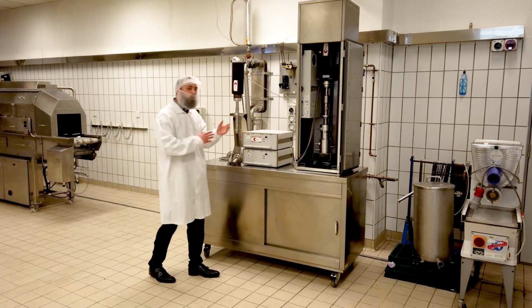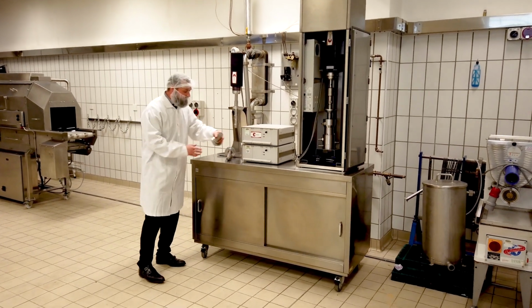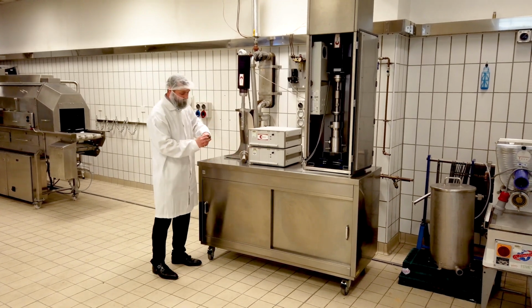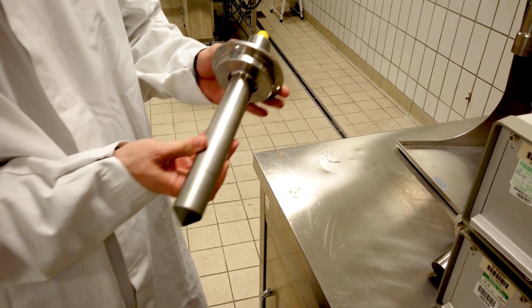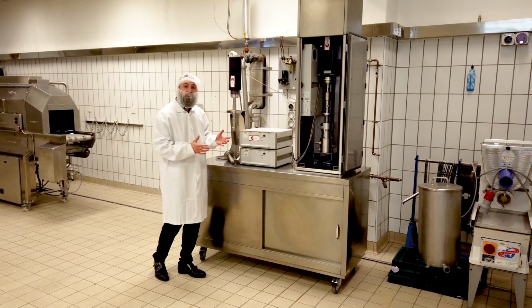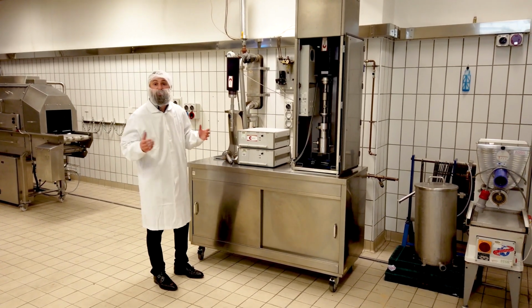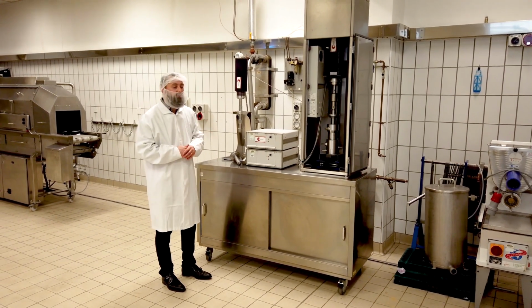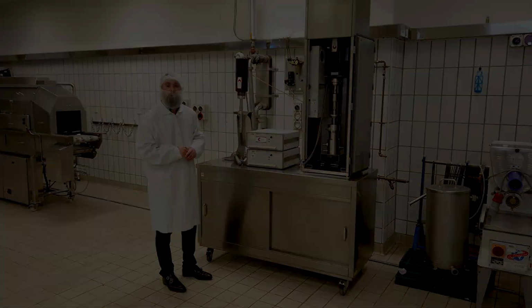These sonotrodes come in a range of different shapes and sizes. Here's a more flat sonotrode, and we also have smaller but longer diameter sonotrodes with curved edges, depending on the applications we're looking at. This can be small scale operations, but can also be scaled to much larger commercial operations. It is used in the pharmaceutical industry for a wide range of applications.